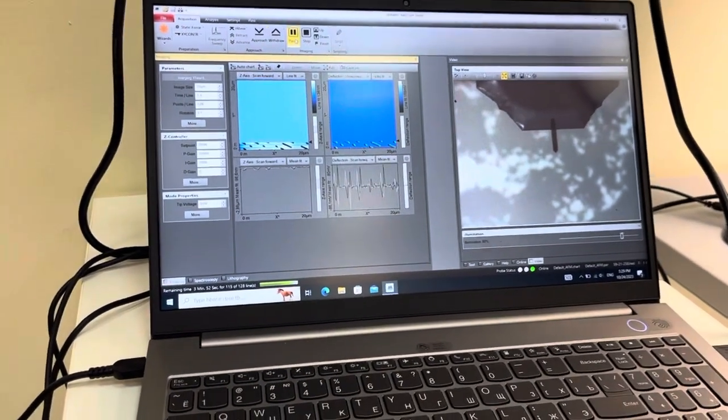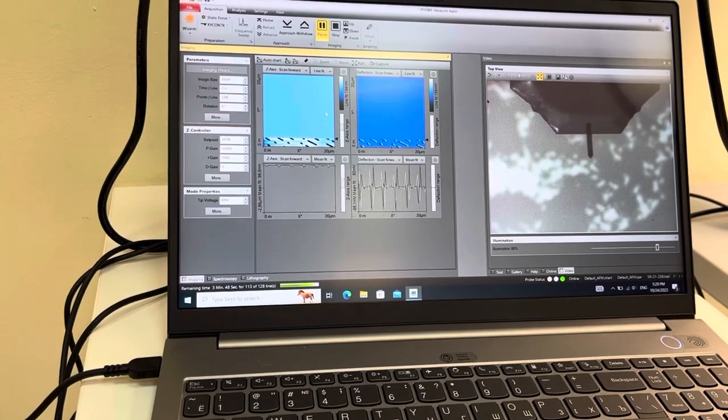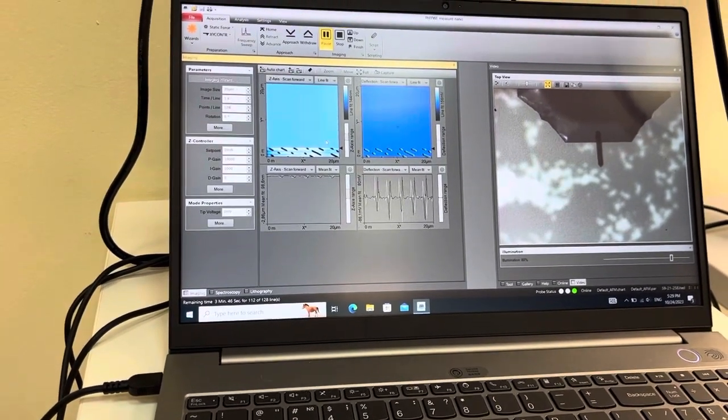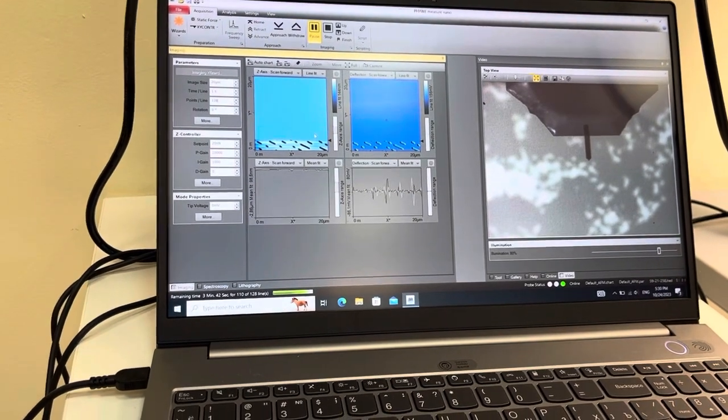Before doing any scan, for each sample there is a different image size. So in order not to waste your time, you have to open the manual and see what image size was taken for every sample.